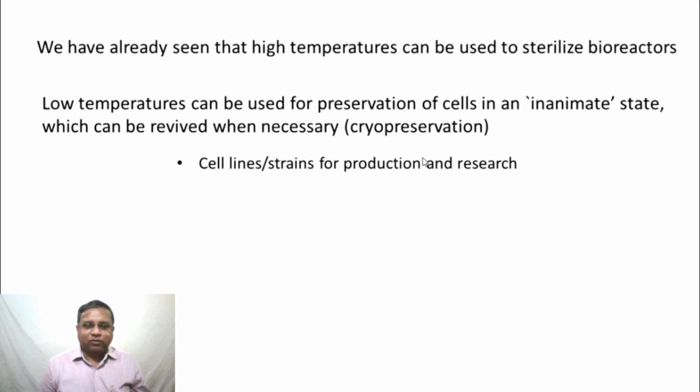Whenever the power goes down, one of the biggest concerns is the minus 80 degrees C refrigerator, that freezer, is that going to get affected. When we designed our buildings, we had to ensure that we had dedicated power lines which were supported by the UPSs and so on, so that there would be continuous power to those minus 80 degrees C freezers. So it is rather crucial, and it is done all the time.